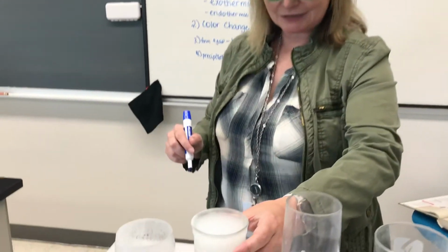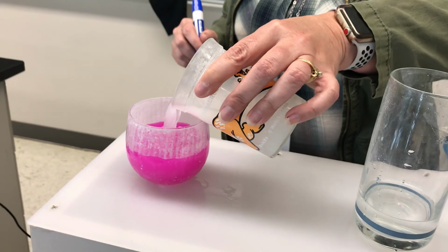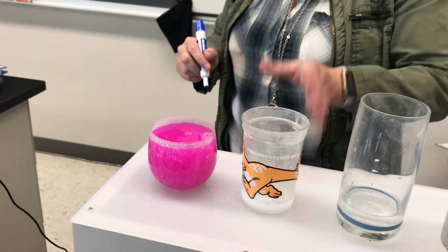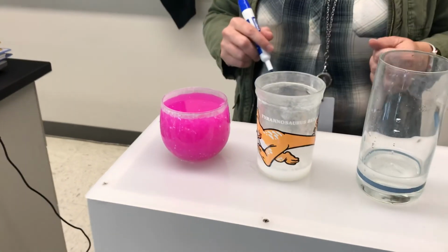All right, last glass. So we're going to take glass 5 and pour it into 6. And it goes back to being that, it's still kind of milky in color, so not clear anymore, but it's that hot pink color again.